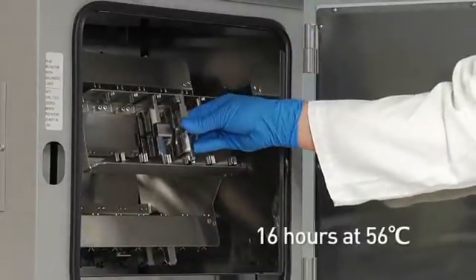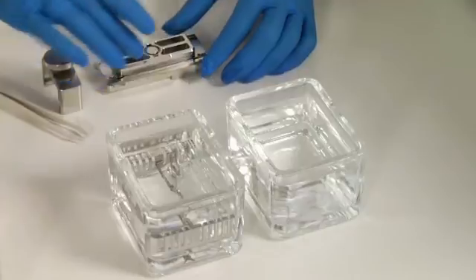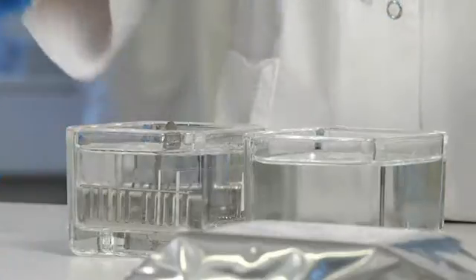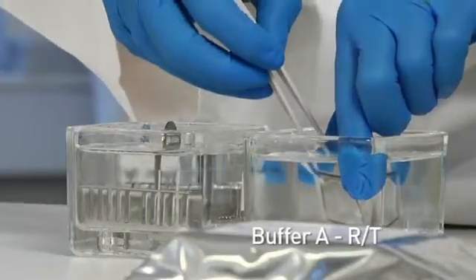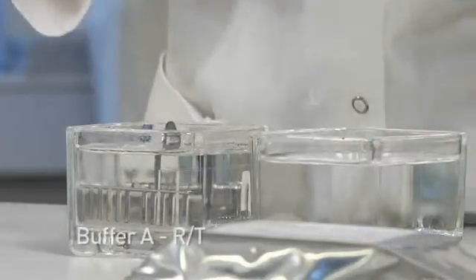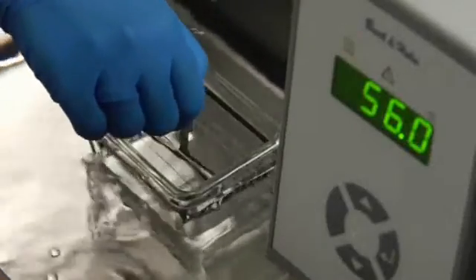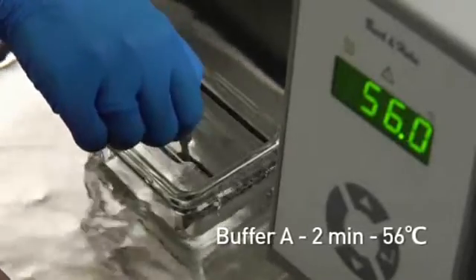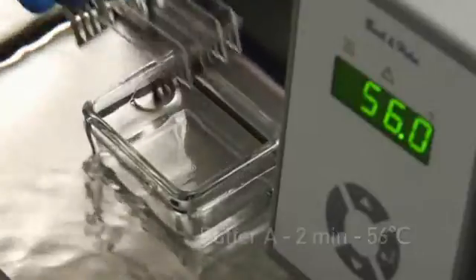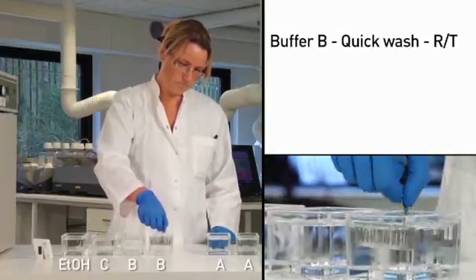Place the chamber in a preheated hybridization oven and hybridize the slide overnight. On the following day, remove the slides from the hybridization chamber. Then carefully separate the slides in buffer A using a pair of tweezers. Transfer the array to a second jar containing buffer A until all slides are ready, then wash the slides in preheated buffer A for two minutes by moving it up and down while keeping it submerged. Transfer the slides to buffers B and C for additional washes as shown.